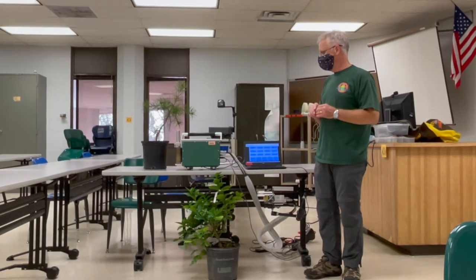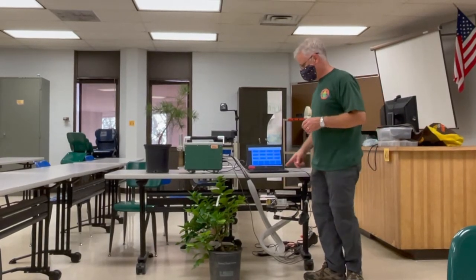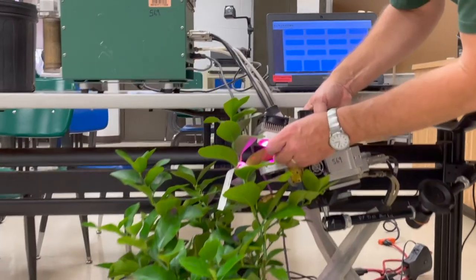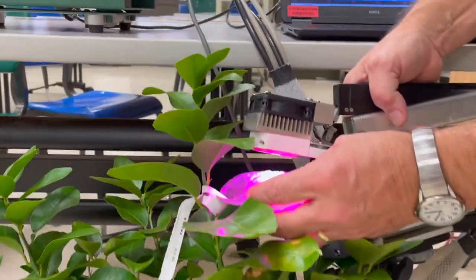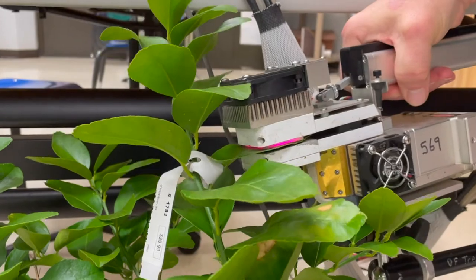First, what we're going to do is put a citrus leaf in the chamber. You want to put it in there so it covers up the entire opening in the chamber, and we seal it in there.